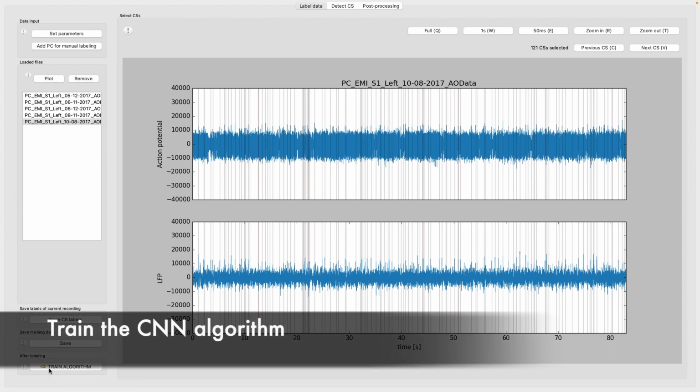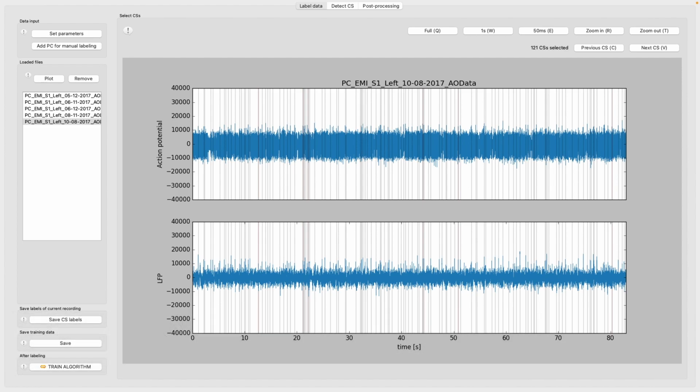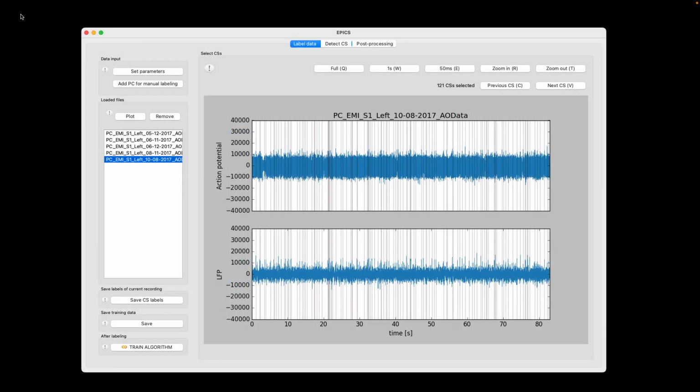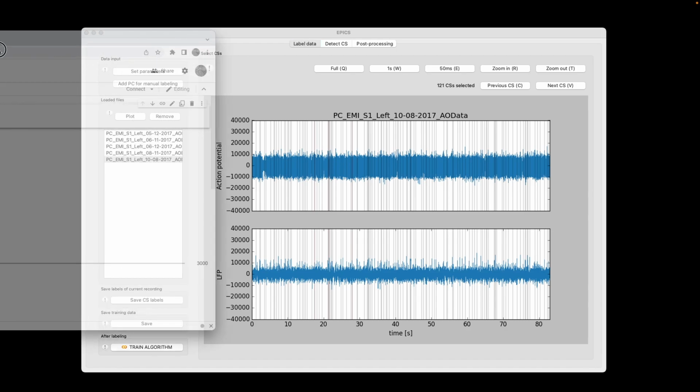What this will do is basically it will open your web browser. The settings of this web browser should be such that, I'm using a MacBook, so my default would be Safari in this case, but the problem is that it does not work with Safari. So please adjust your default browser settings to Google Chrome, which would work in this case.